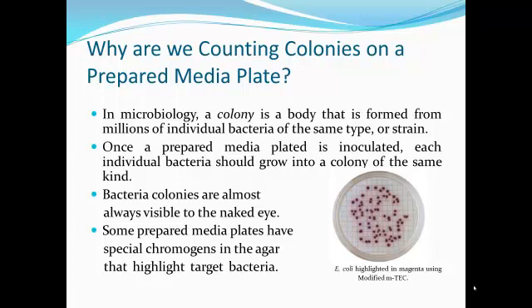The E. coli shown here are highlighted in magenta because the modified Entec has a special chromogen in it, which brings that color out when they metabolize the chromogen.